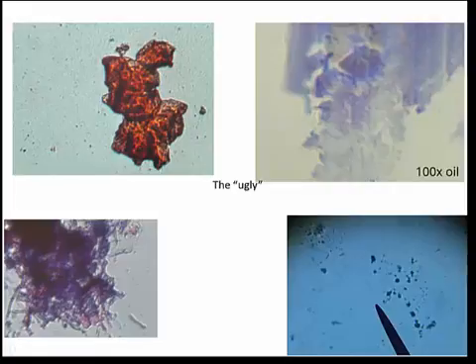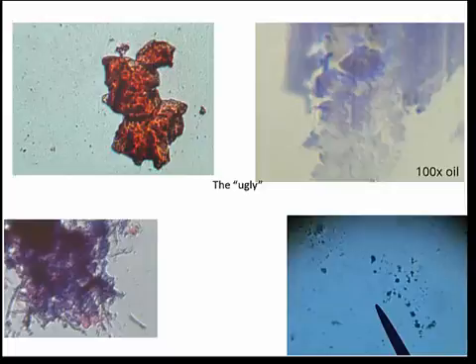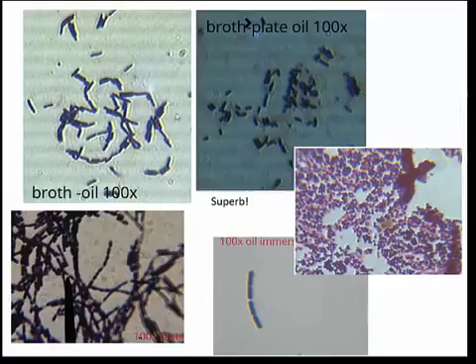I hope this has been helpful. I wish you all well on your microscopy. I hope you enjoy it. Remember, patience is a virtue, and I really look forward to seeing images, particularly of your cheek cells and of your bacteria cells, posted in the discussion board, or if you don't do that and you do fruit fly instead, that's fine. But when it gets to the point where I see your lab report, I'm really looking forward to some good images. Hopefully something like this.